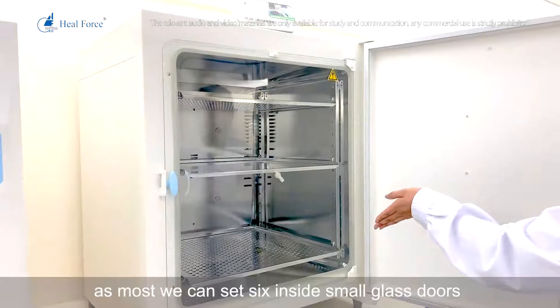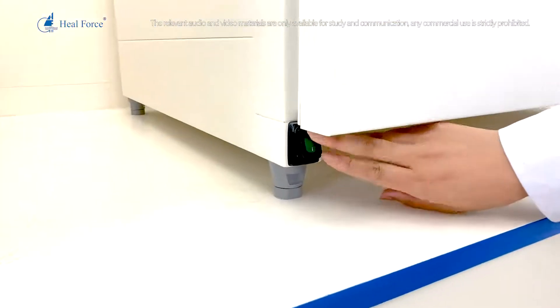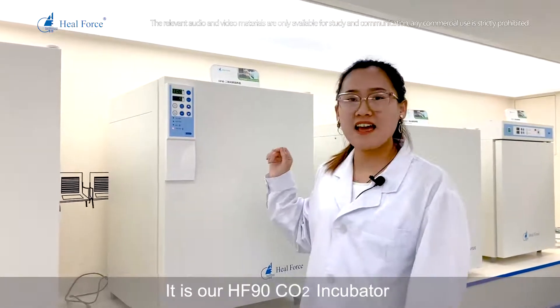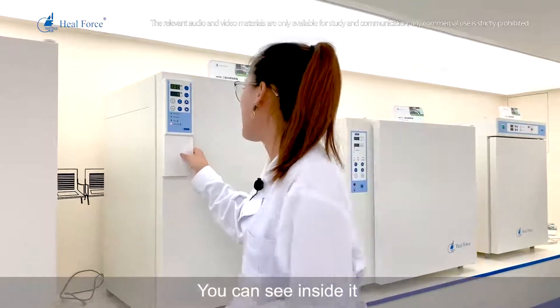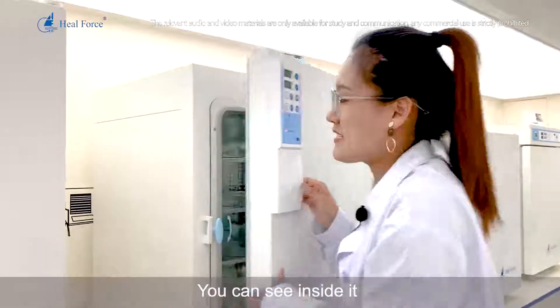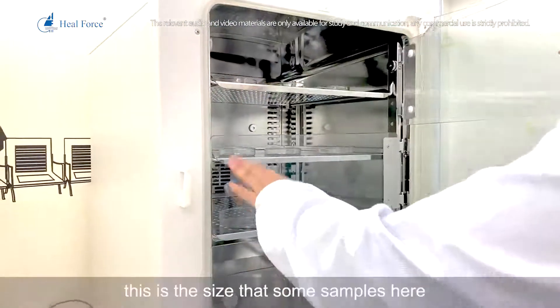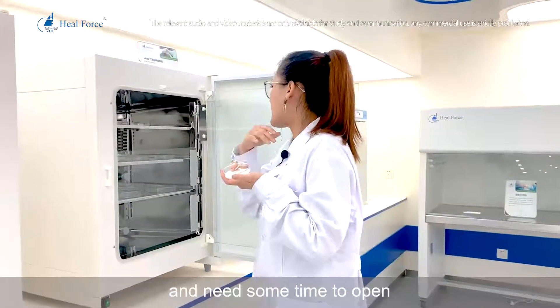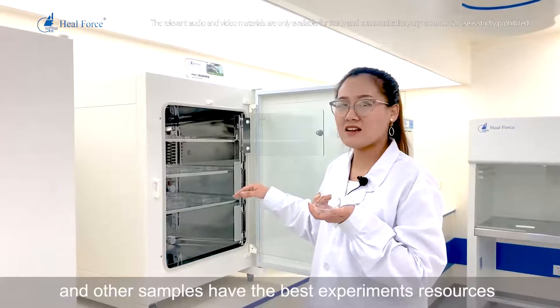Next is our best-seller carbon dioxide incubator: the HF90, with a volume of 151 liters. It features a touch-button control panel with an auto-start process. It has one large glass door and three independent small glass doors. When you need to move a sample from one section, you can open just one small door while the other doors remain closed, maintaining a steady environment for the remaining samples.